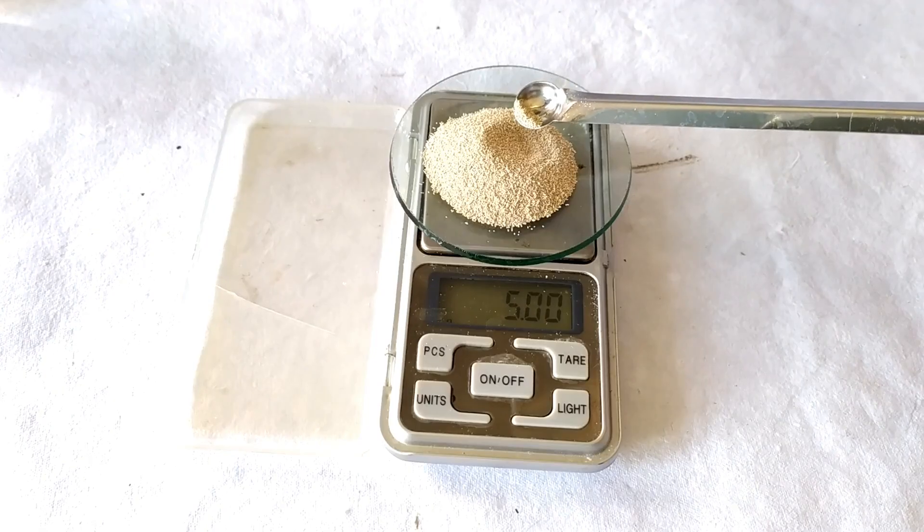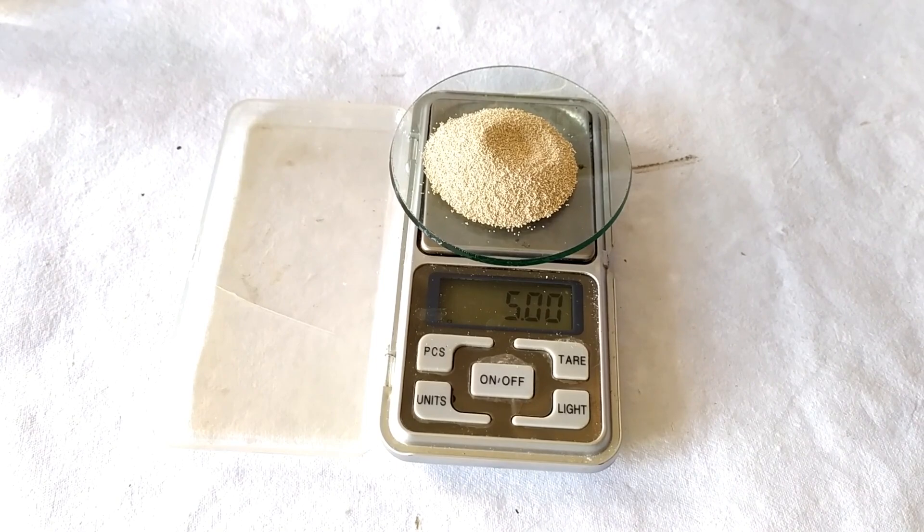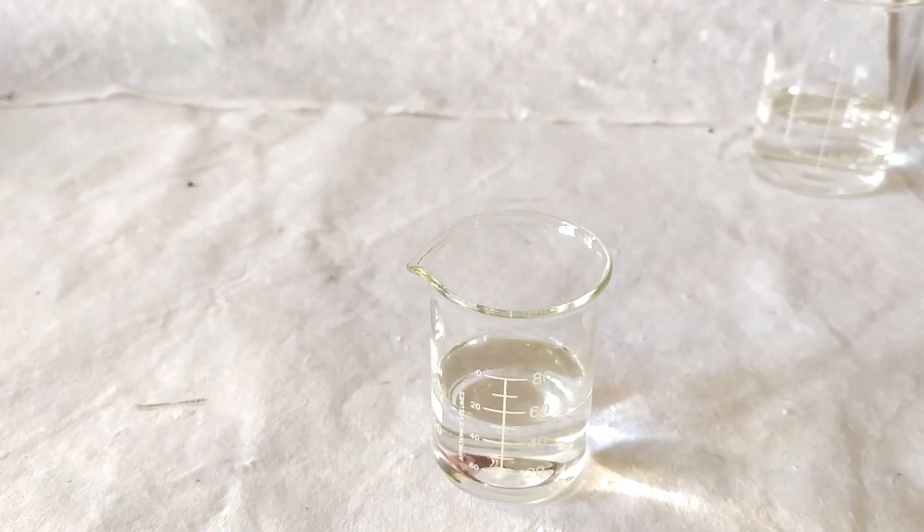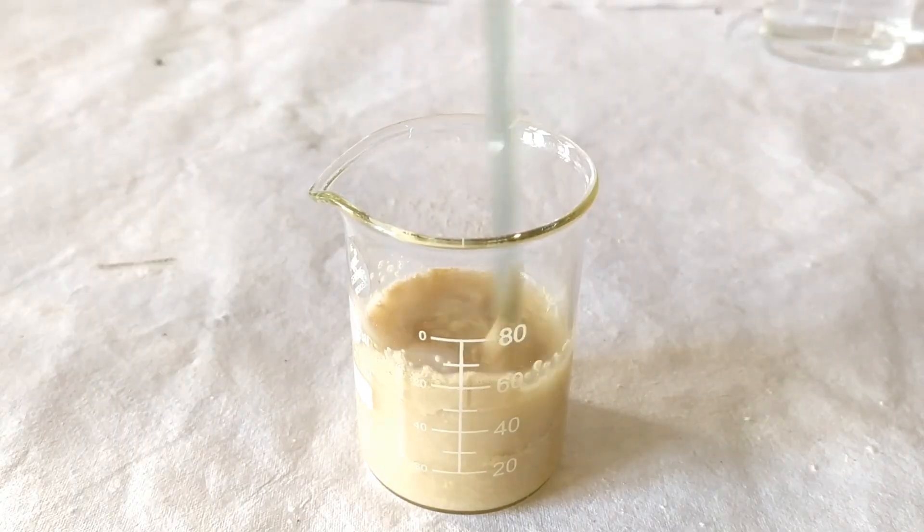Also prepare a small quantity of 10% yeast suspension by adding approximately 5 grams of baker's yeast to 50 ml of boiled and cooled water in a beaker and stirring the contents.